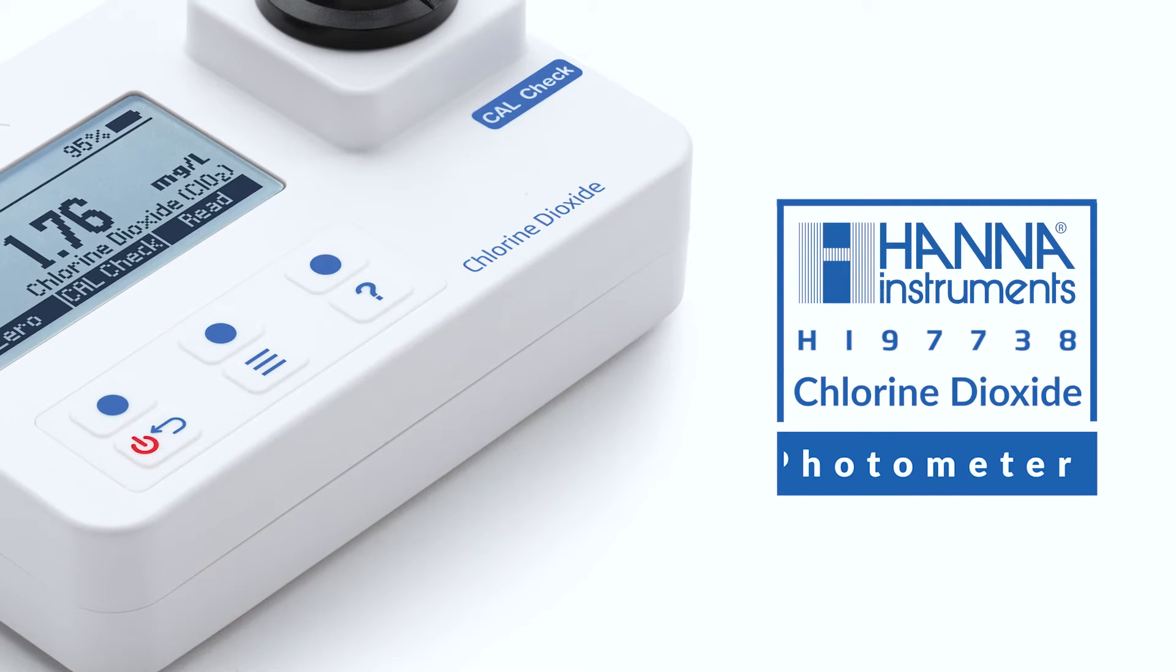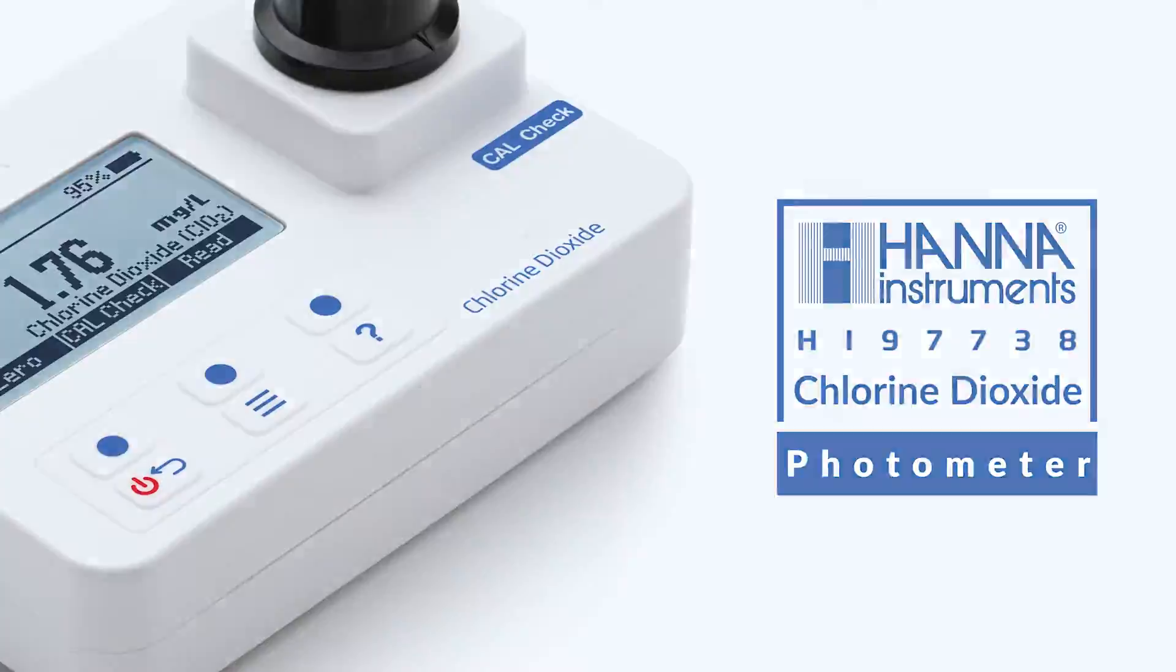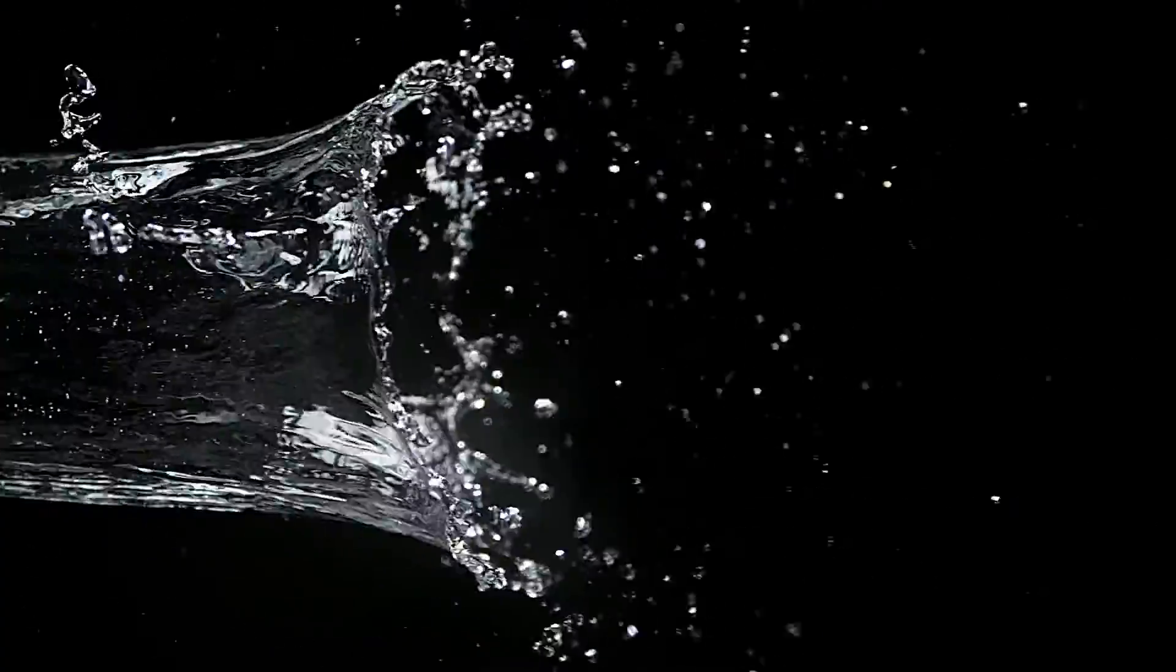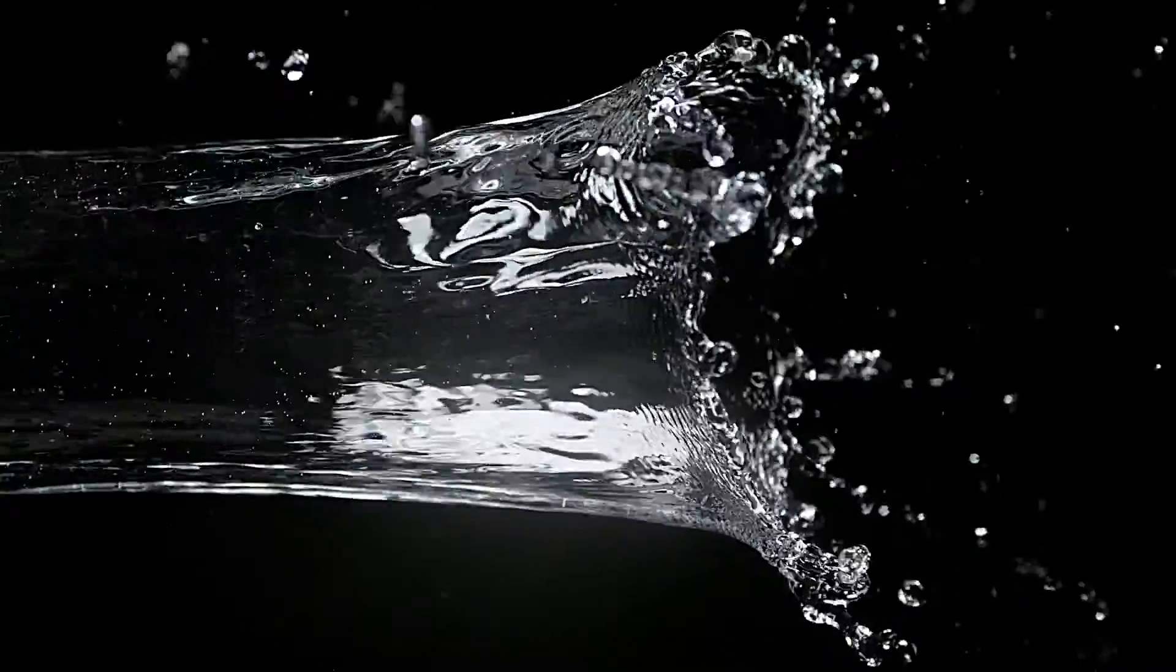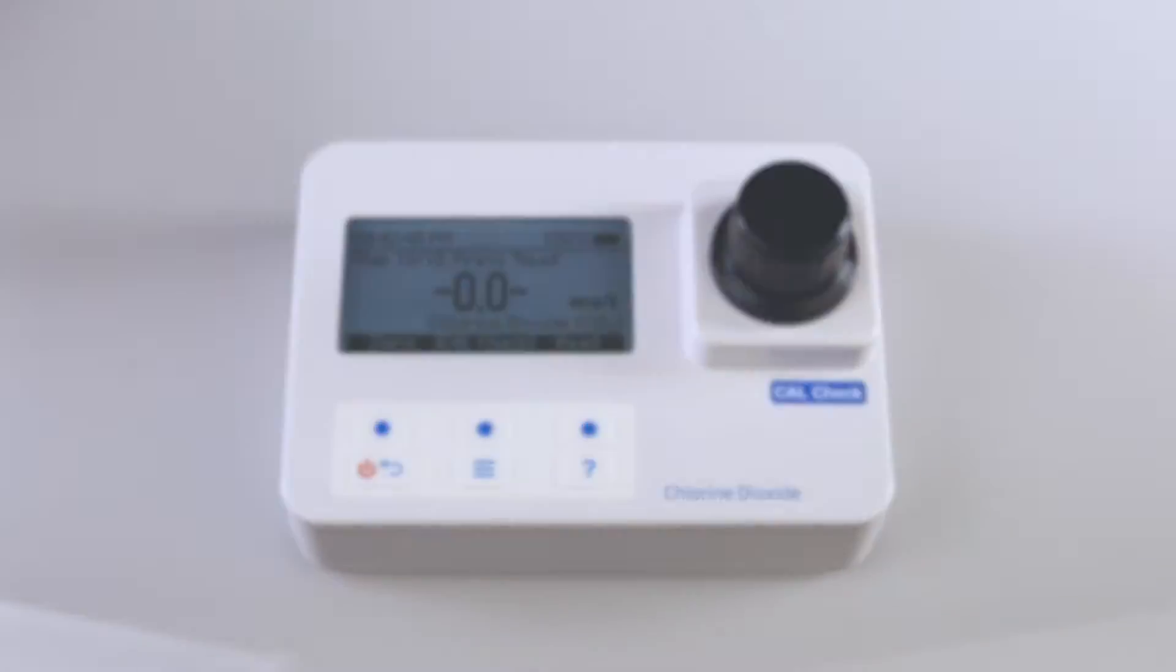The Hanna Instruments HI-97738 Chlorine Dioxide Photometer is an advanced portable photometer for the measurement of chlorine dioxide with a range of 0 to 2 milligrams per liter in water. Today we'll go over the proper use of the HI-97738.